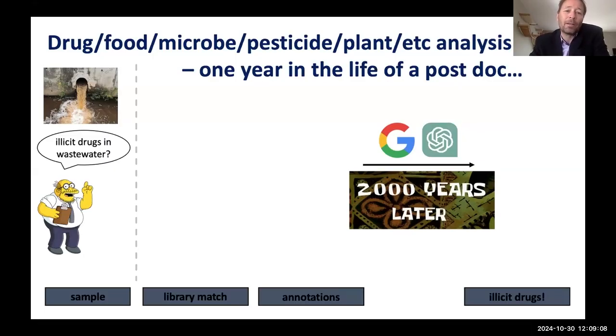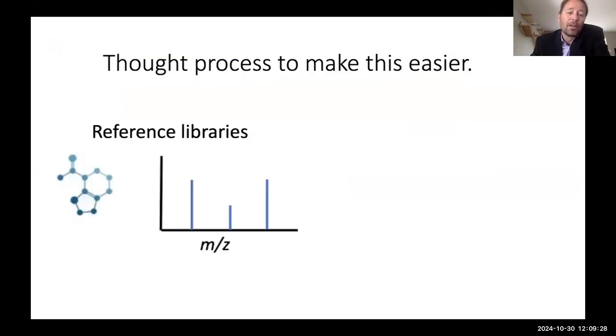Somebody might assign a molecule to a microbe, whereas somebody else may assign it to a food, and in reality, it may be present in both. And so this represents one of the limitations in untargeted metabolomics that my laboratory faced over and over and over.